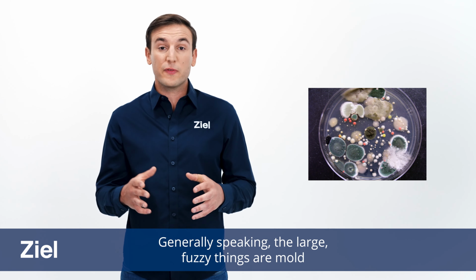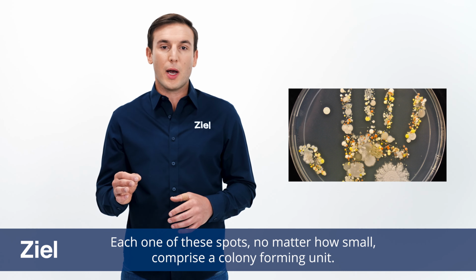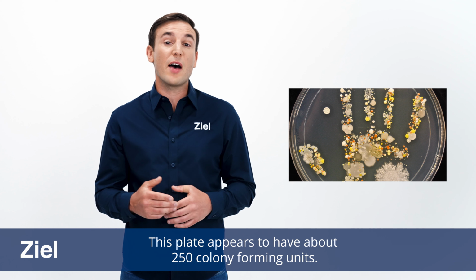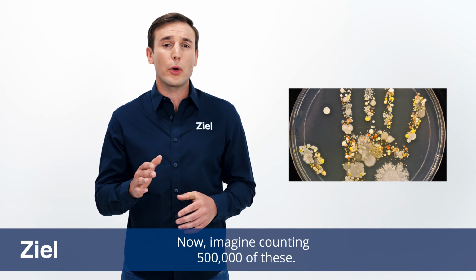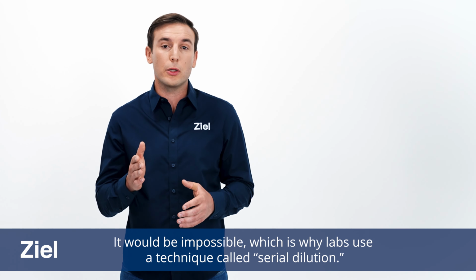Generally speaking, the large fuzzy things are mold and the small circular dots are yeast. Each one of these spots, no matter how small, comprises a colony-forming unit. This plate appears to have about 250 colony-forming units. Now, imagine counting 500,000 of these. It would be impossible, which is why labs use a technique called serial dilution.